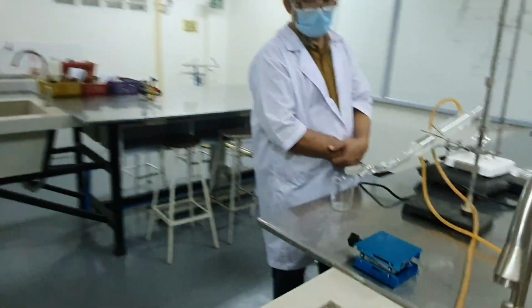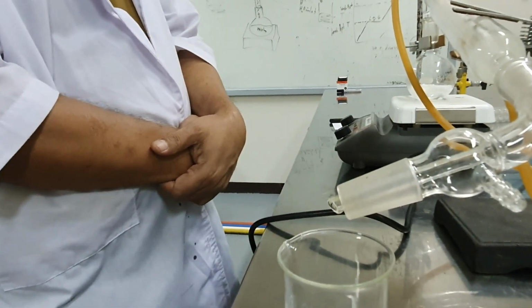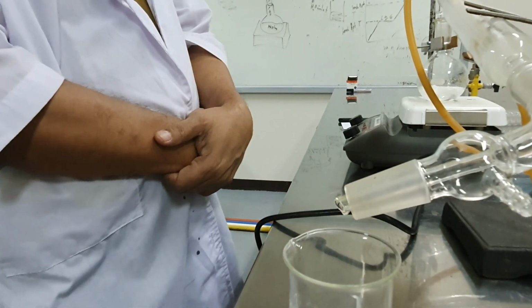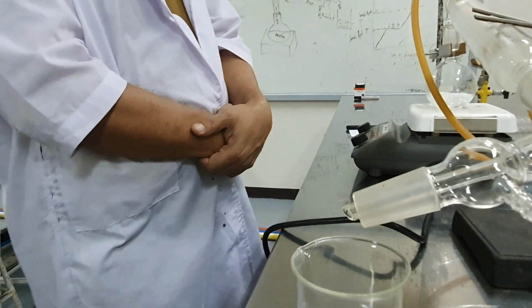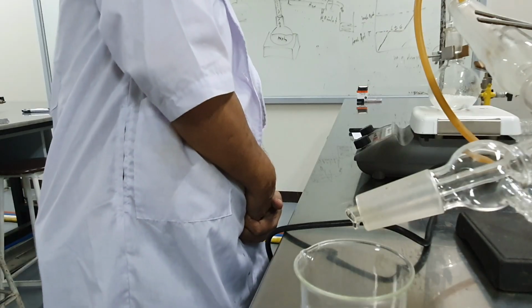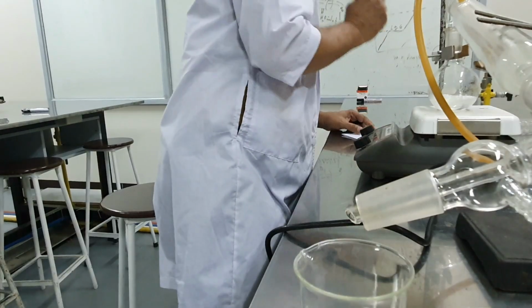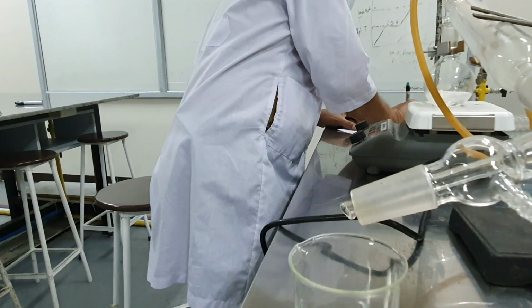I have to read. So this is 63. So 1 ml, 63 degrees.